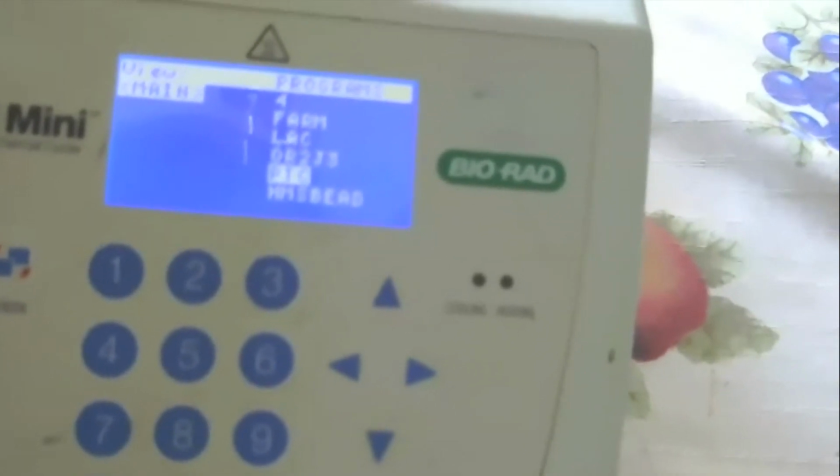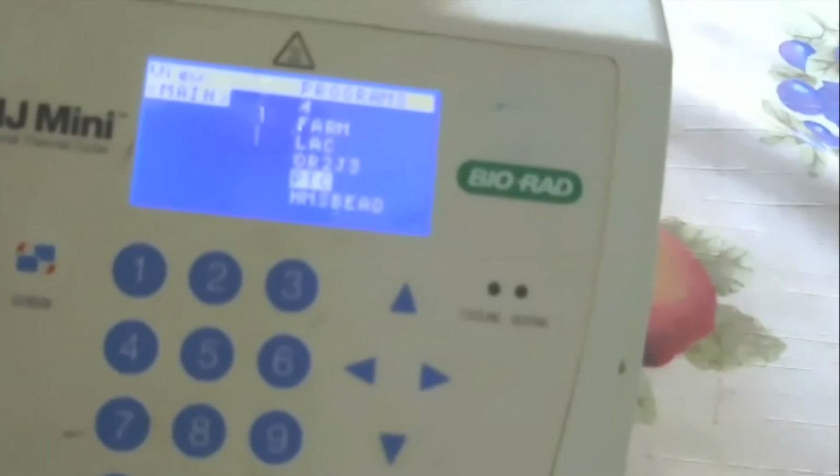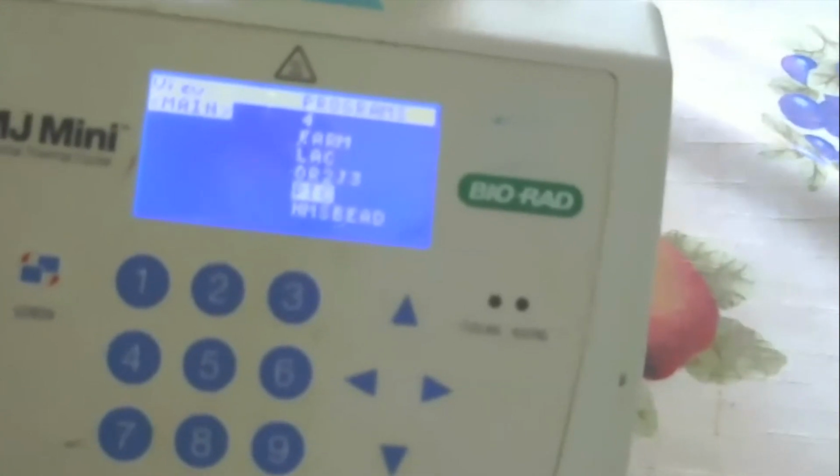Add into this PCR tube. You touch the pink reagent, press down to the second stop, and then keep pressing, back out, and then release your thumb. All right, that way you squeeze all the liquid into the reagent. Now you're ready to go for PCR. Now you see on the screen of this PCR machine, I have a program named PTC. That's the program we're going to use here today.